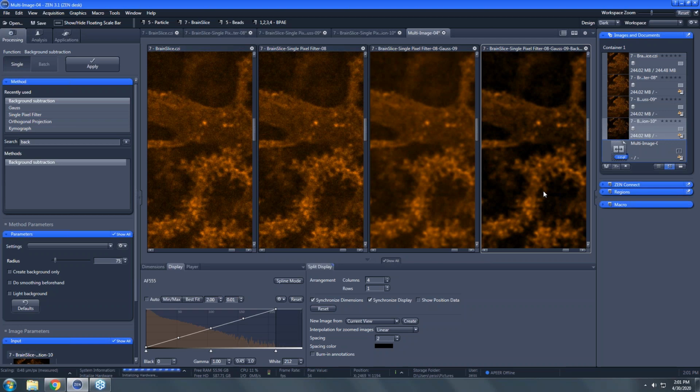Can you explain the display interpolation versus these adjustments? Is the interpolation coming through when you export TIFF images? Aha, yes. It's very understandable to be a little concerned to realize that Zen is interpolating your pixels as you're zooming in and out. It doesn't adjust the data in any way, and when you export images, there's no interpolation. I guess the only time that it would impact you at all would be if you're taking a screenshot, but hopefully you're not taking a screenshot of something and then trying to do image analysis on it. So that would be a poor workflow for any number of reasons apart from interpolation.